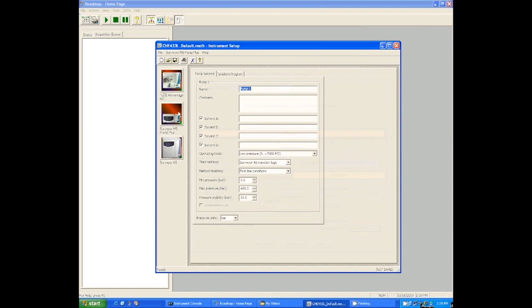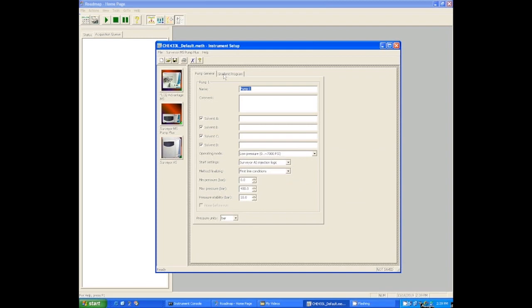So we want to do the LC first. When you click on the picture of the LC, it should bring up this window that has two tabs. And really, the major thing you're changing, just like the temperature program in the GC, is the gradient program. So you want to click the tab for the gradient program.